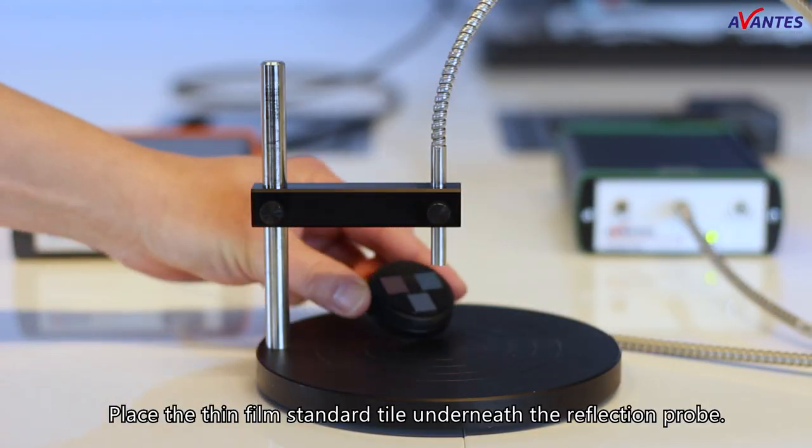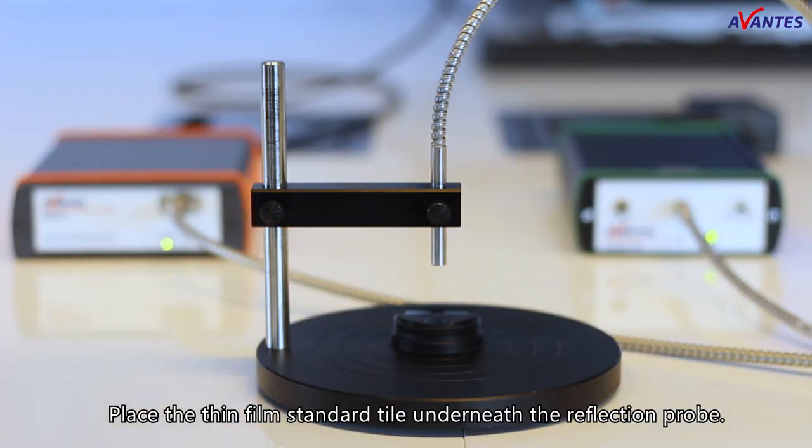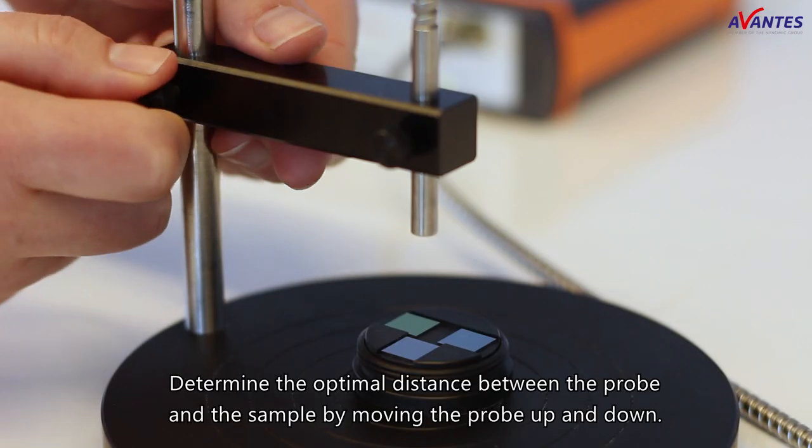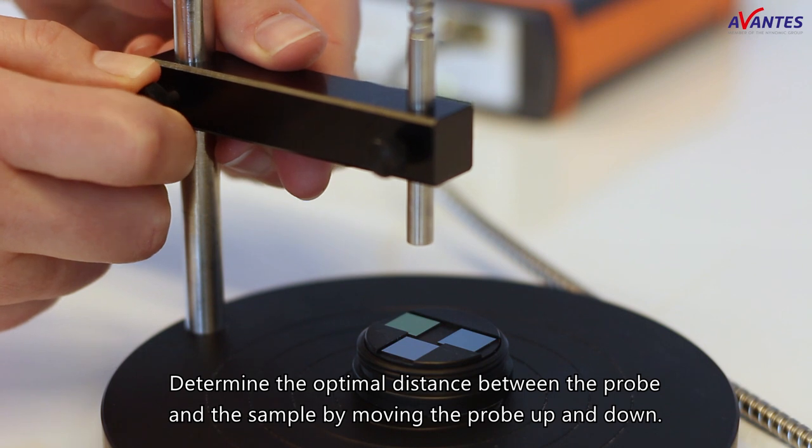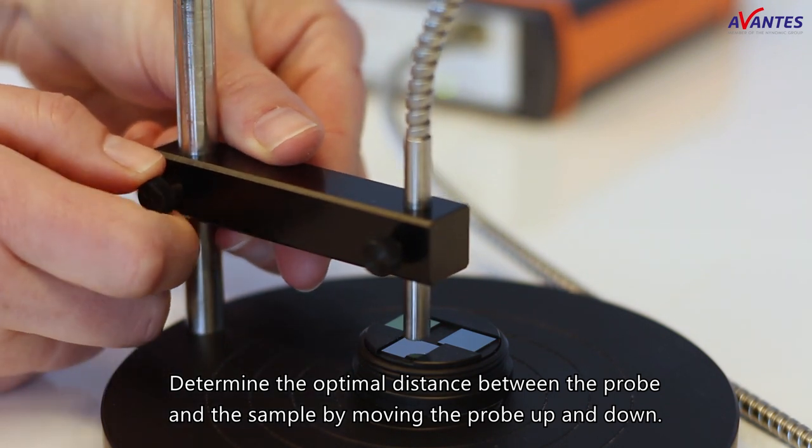Place the thin film standard tile underneath the reflection probe. Determine the optimal distance between the probe and the sample by moving the probe up and down.